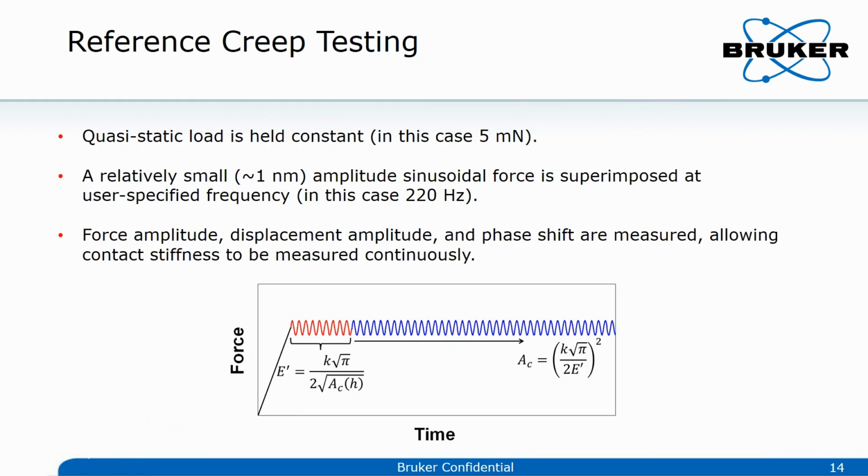A creep testing experiment of 10 minutes shall be employed at different temperatures on the PM2000 alloy up to 700 degrees C. The tip is heated up prior to the contact with the sample by the convection of the gas and by the close-by heaters in the Exol heating stage. We are talking about an isothermal contact situation.